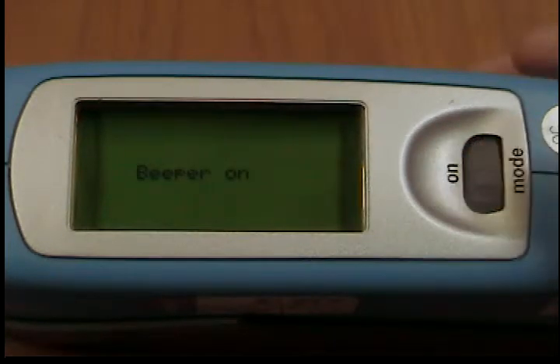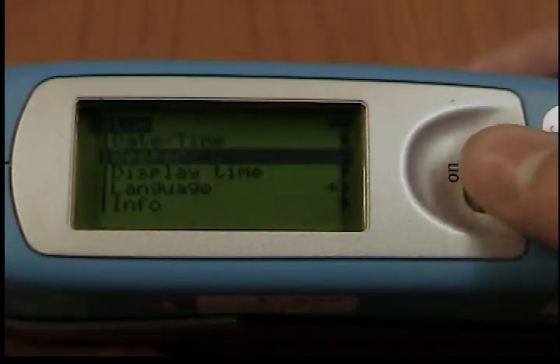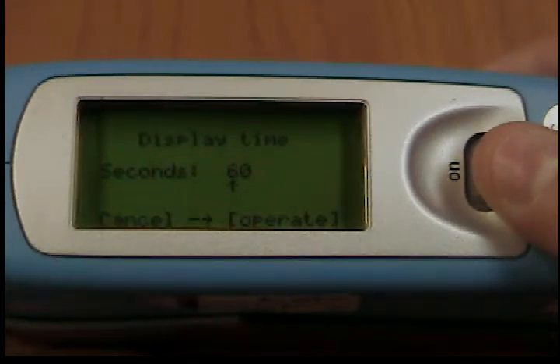Display time. To save electricity, the unit automatically turns off after a certain amount of time. You can determine this time yourself with the display time setting.